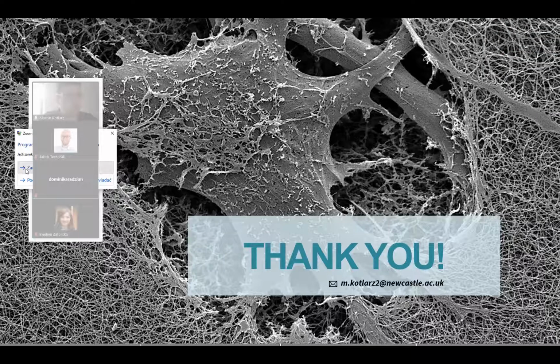I was just asking whether this biopaper is some artificial polymer with just small peptides of ECM proteins, or you actually use natural, for example, collagens or fibronectin or other proteins which would also naturally exist as this scaffold around cells. Yeah, okay, thanks for that question. So it really depends on the application. We use different biopapers for wound healing. These were natural polymers made of calcium alginate, for example, that is a popular material for wound healing. Even the bioink we are printing is made of proteins like collagen and fibrinogen that naturally exist in the human body. But for orthopedic applications where you use metal implants, this is a synthetic metal, pure grade titanium that is used also commercially for operations and surgeries.